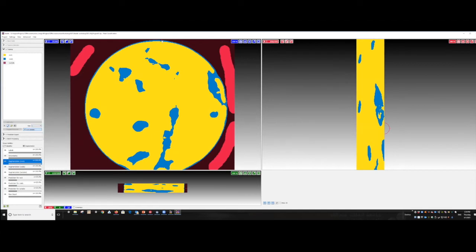So we click on this blue line and keep live update on. Click on it here. Maybe a bit more and it will automatically just change that. You can see here. And over here, I know that this is a void. I can go here and click on the void layer, click that. And you can see that it just automatically adjusted the whole image. Over here too.